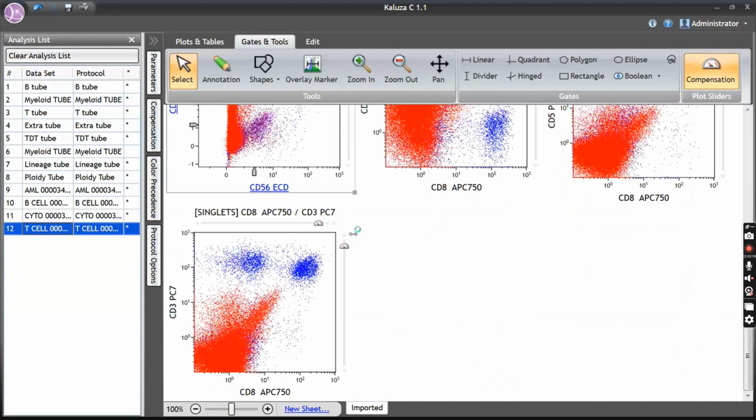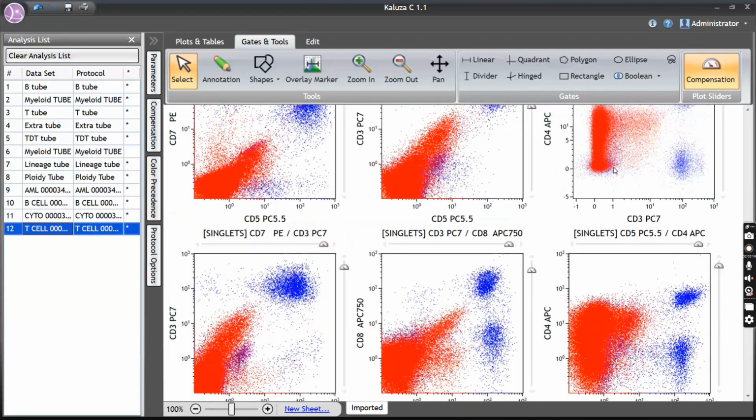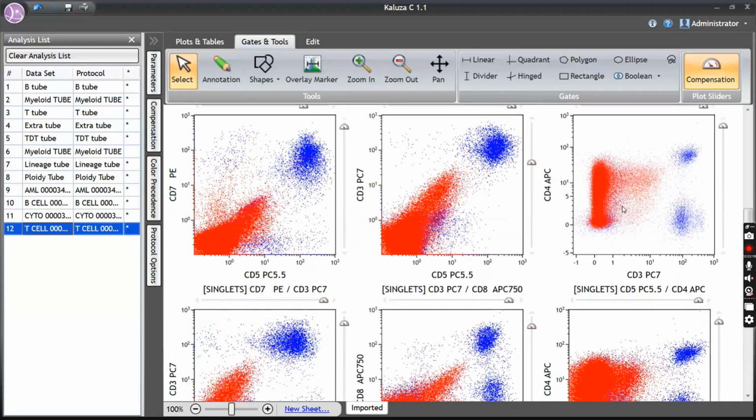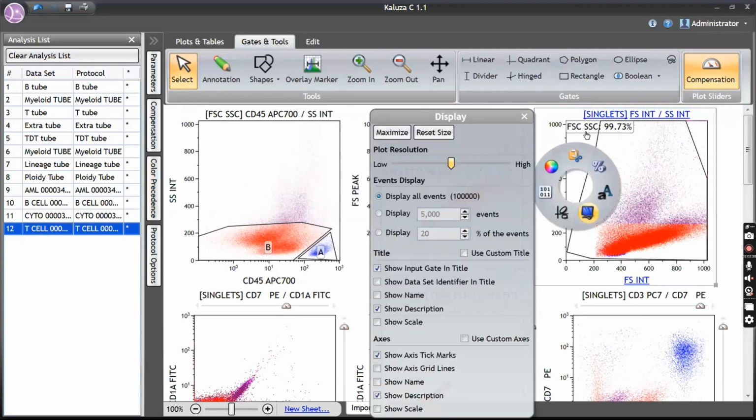But I couldn't answer why this CD4 is there. Why should CD4 be positive like this in a B-ALL case? That is something strange. B-ALL with aberrant myeloid markers in an adult could be because of Ph-positive B-ALL. That is fine. But why CD4 should come is something I couldn't answer. True that. I don't know the answer exactly. This is really a challenging case.